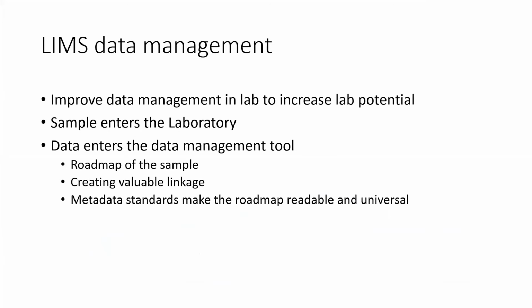So I'm going to talk about laboratory operations specifically. Data management is improved by using a tool such as the Laboratory Information Management System. This increases laboratory potential. So if we think of a sample entering the laboratory, that sample is a form of data.